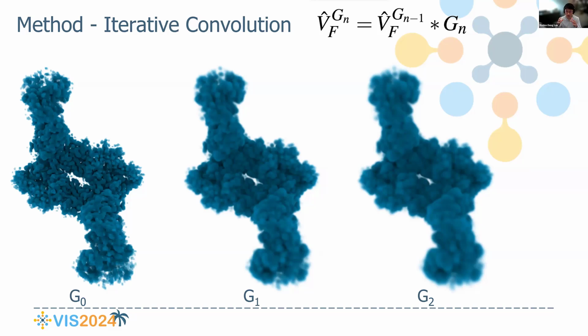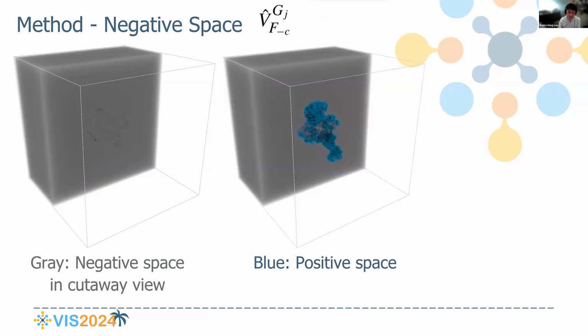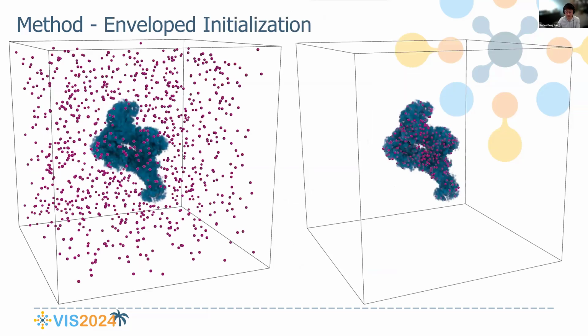Apart from giving us a bigger region of influence for the gradients, it also happens to mitigate the noise inherent in the cryo-EM data. The second strategy is to fill the voxels that do not pass the threshold with a negative value. In ChimeraX's fitting map optimization algorithm, there is only a positive reward for the atoms occupying a density. With this negative space, we also add a negative punishment for the atoms that do not occupy a density.